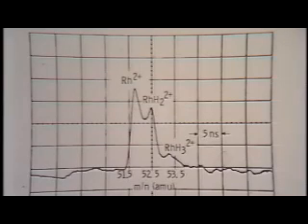The reason it works so well is that all the species come from the same point in space. There is no uncertainty about what the distance is. And since they all field desorb more or less at the same time, they all accelerate through the same voltage, so they all have the same kinetic energy. That's why the mass resolution is so good. Now it turns out at higher masses it gets progressively worse, but if one is willing to play experimentally, one can get better than single mass resolution at mass 60. We're limited with the imaging atom probe in its simplest form to about single mass resolution up to m/n equals 60.